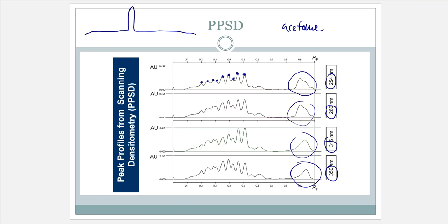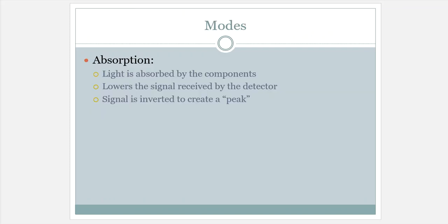All right, so that is the mode. Just like with UVs, they are absorbance based. It's absorbing the UV light. It is eating that up, and that makes those bands darker on the plate according to the eyeballs of the machine. And therefore, I can get absorbance values, and then I can take that absorbance value and plot it onto a calibration curve. Absolutely. That's exactly why we would use a densitometer.